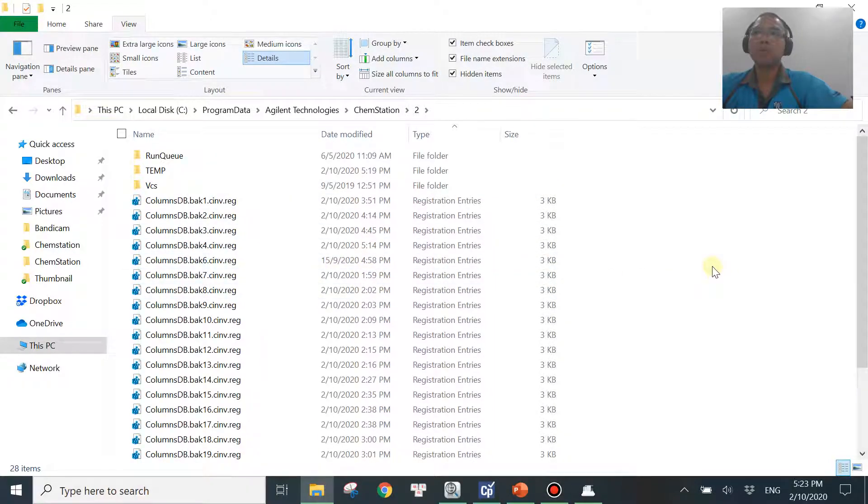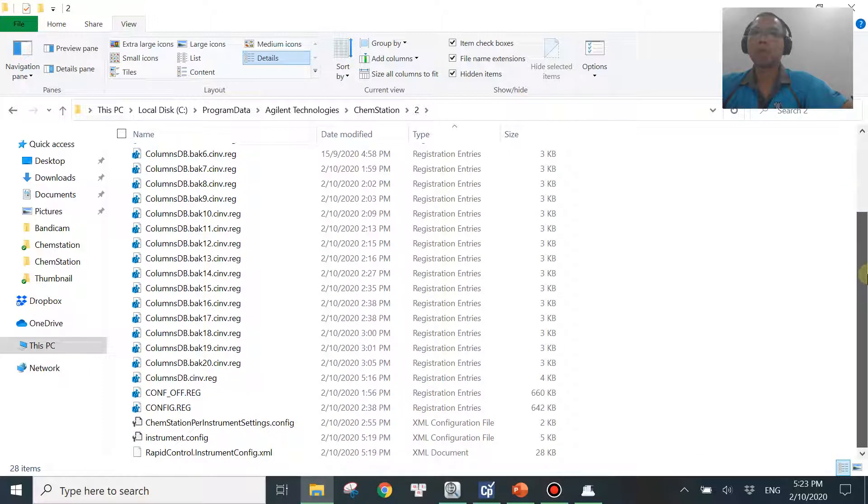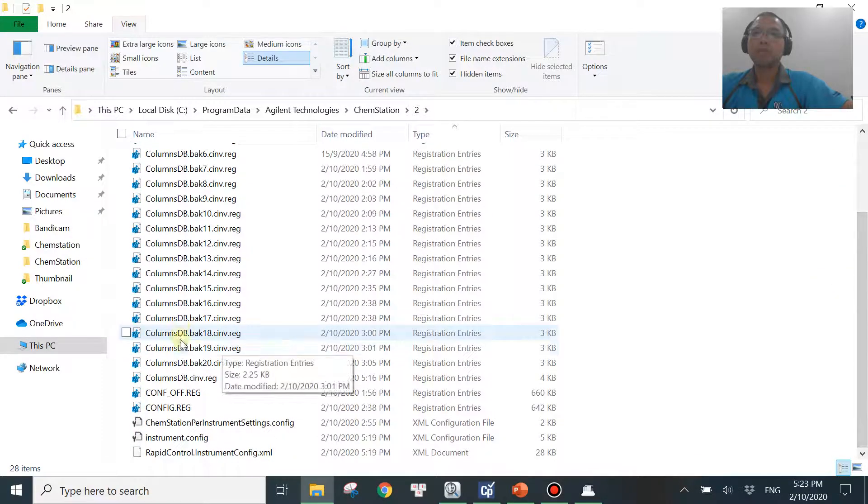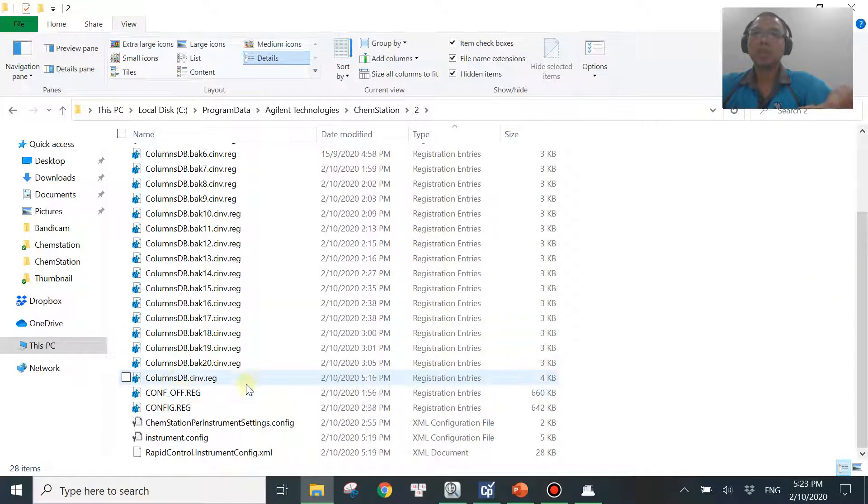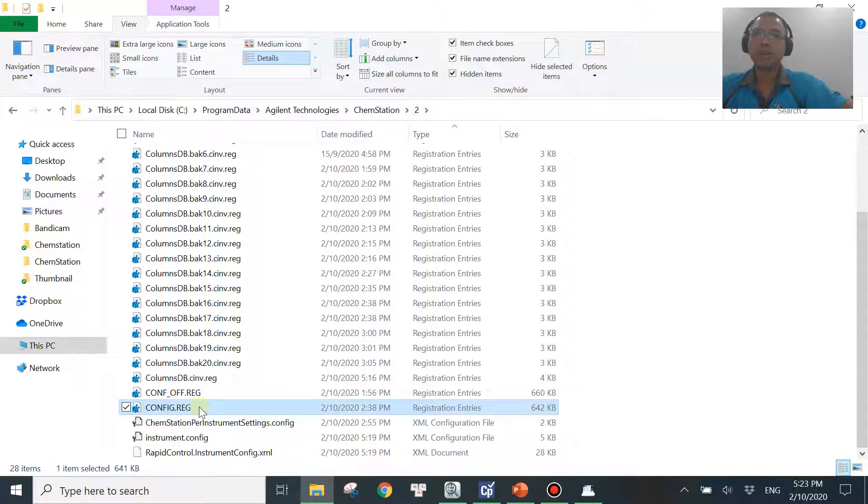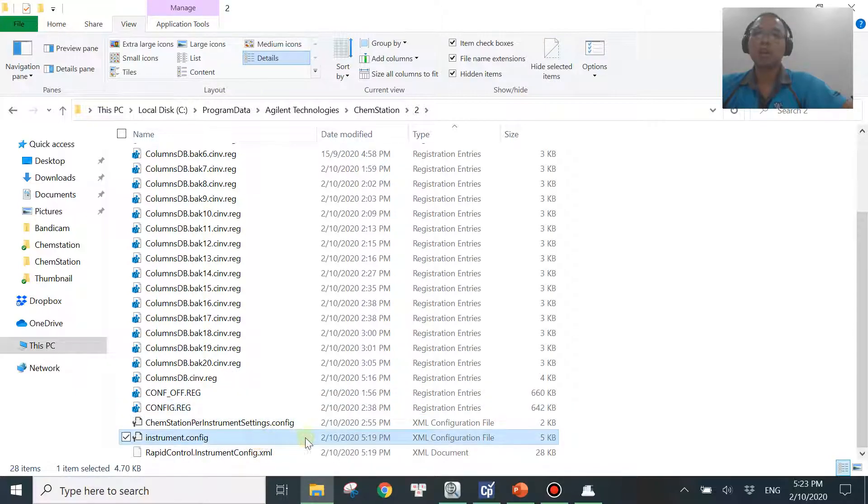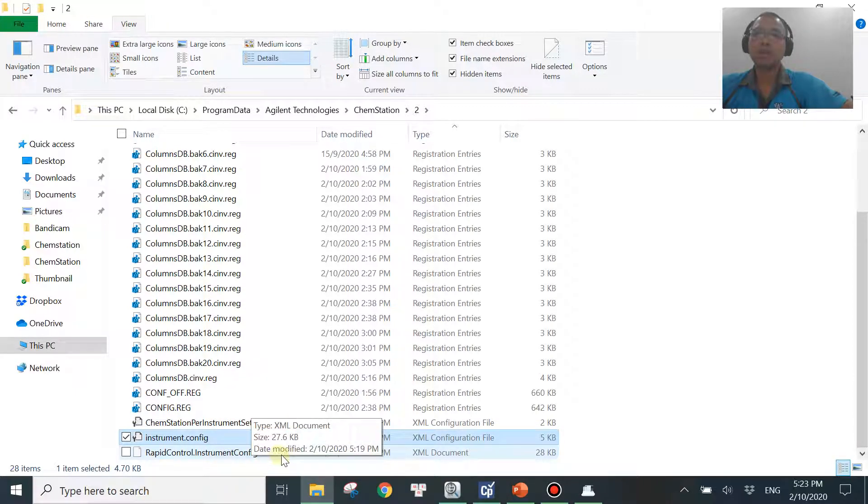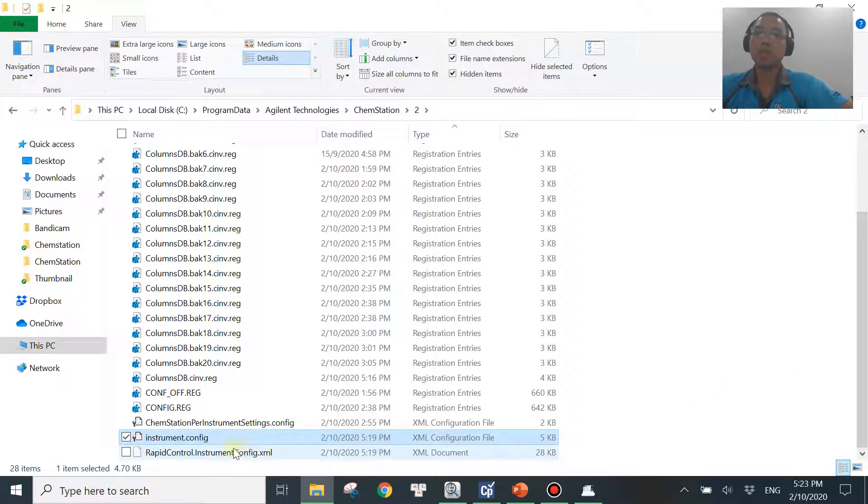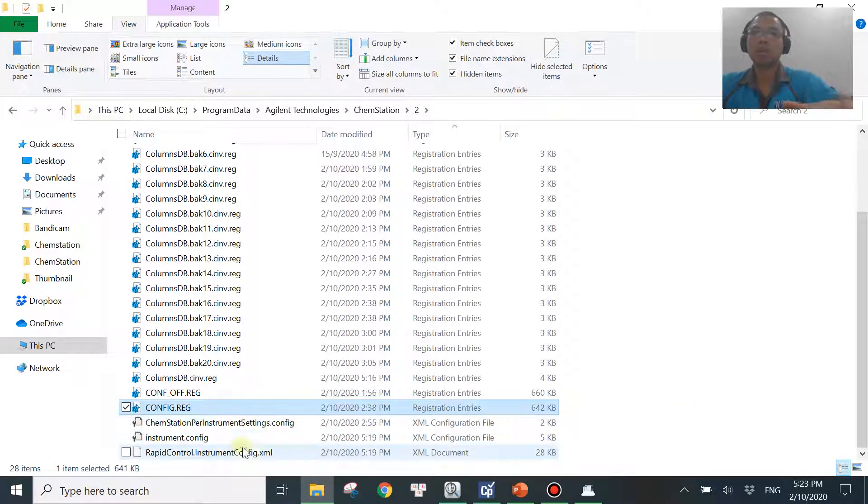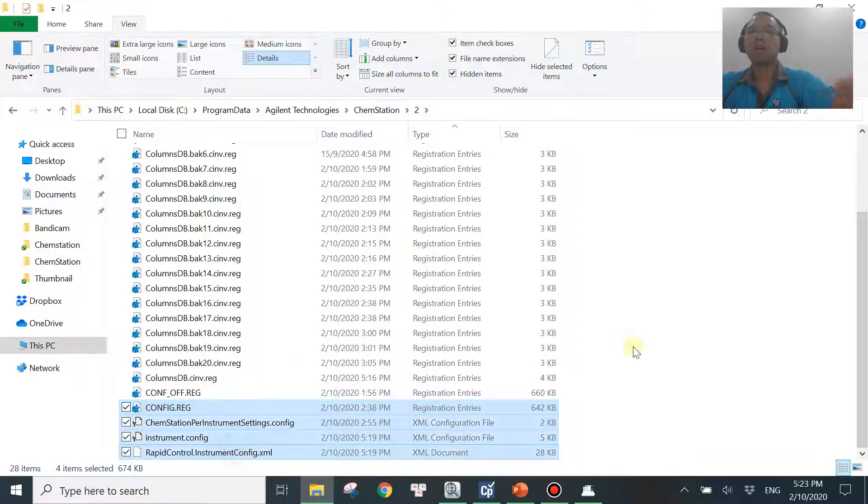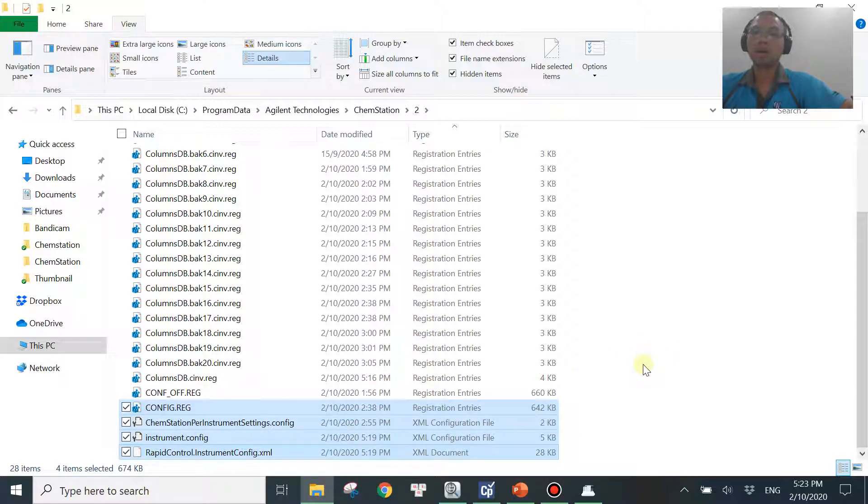And then if you scroll down at the bottom, you'll be seeing four different files. It says config.reg, ChemStation per instrument settings.config, instrument.config, and rapidcontrol.instrumentconfig.xml over here. So these four files are the ones that could be corrupted when you have a power shutdown, sudden shutdown of the PC or power trip, right?